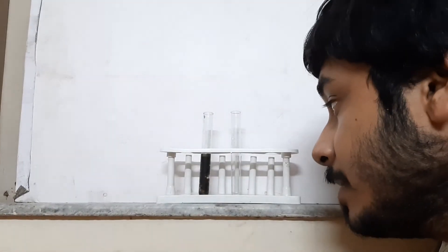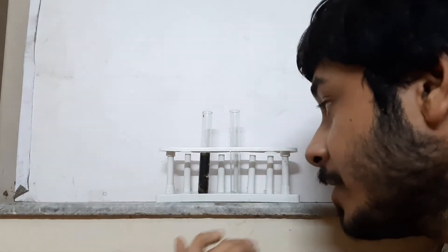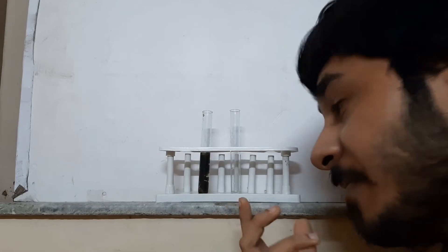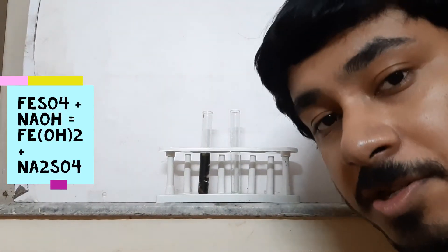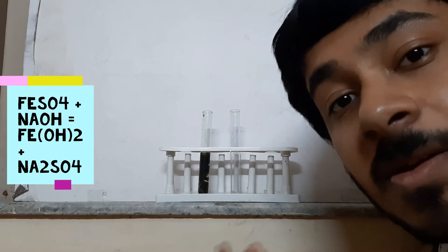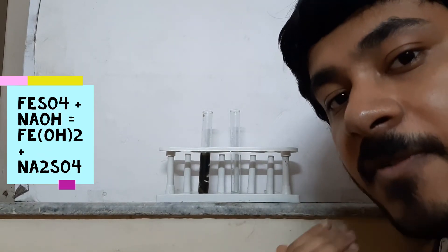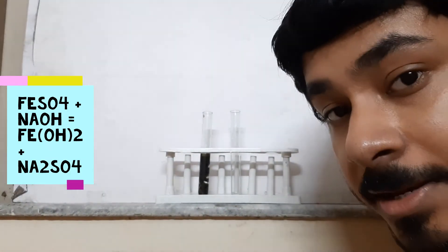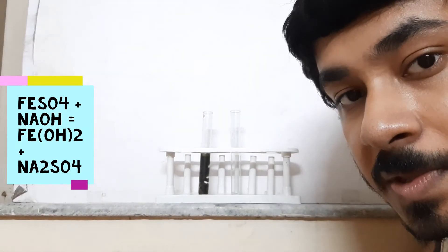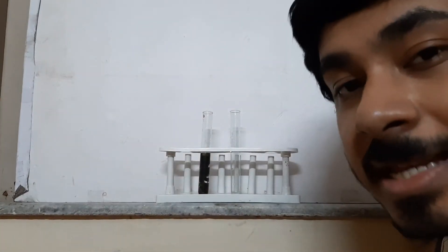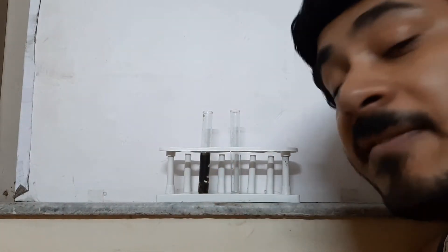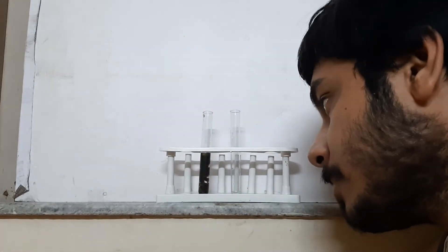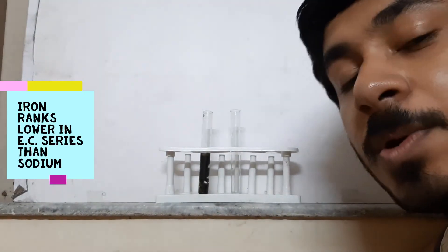As you've seen, it turned into a dark green precipitate. This is because FeSO4 reacts with NaOH (sodium hydroxide) to yield Fe(OH)2 (ferrous hydroxide), and the sodium part reacts with the sulfate anion to give Na2SO4 (sodium sulfate), which stays in aqueous form. Since Fe(OH)2 is insoluble, it comes out as a precipitate.